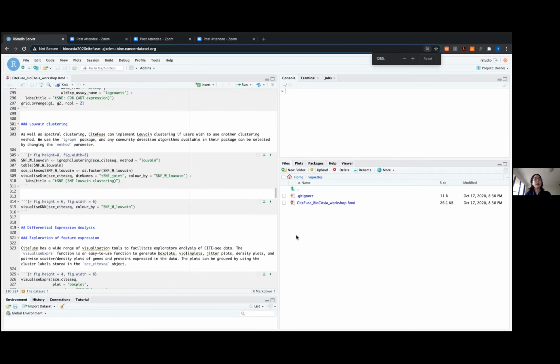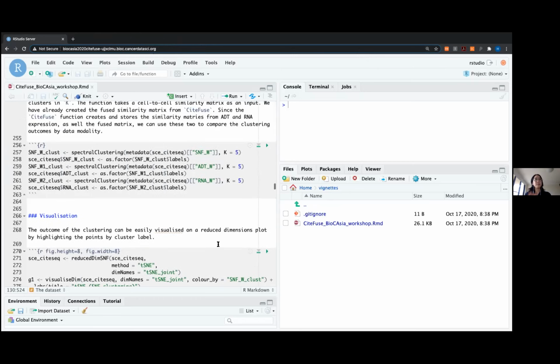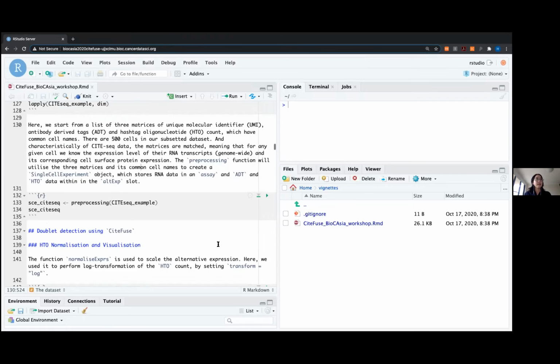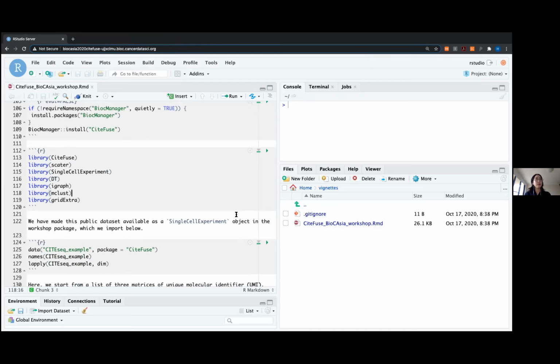All right. So I hope everyone can see my screen, and I'll just increase the size. Thank you for the question, by the way. Many questions are welcome. Just ask questions whenever you would like. Okay, so I hope everyone can see the screen.